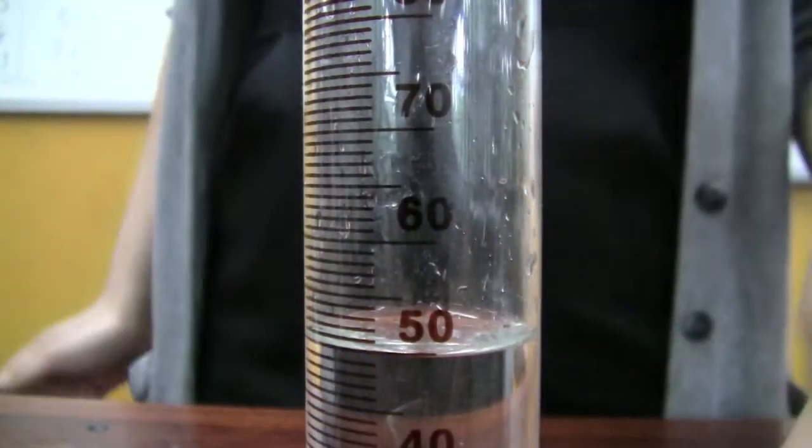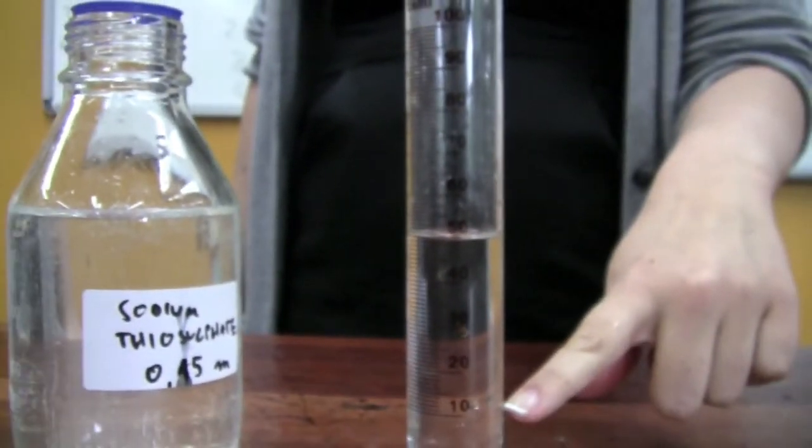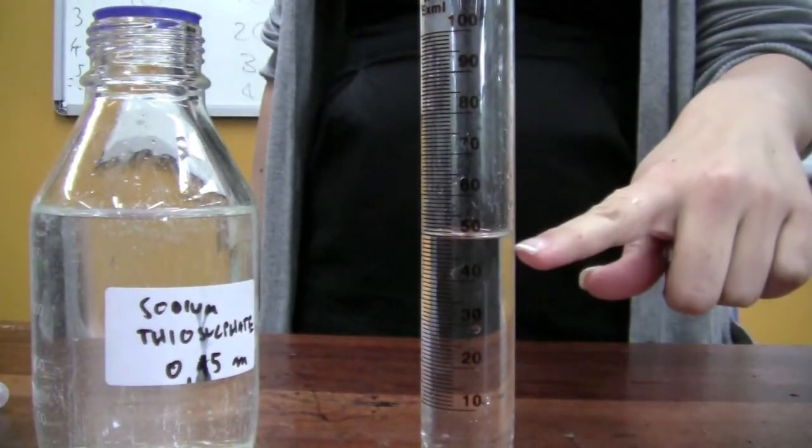So for the fourth dilution, we have 20 ml of sodium thiosulfate and 30 ml of water.